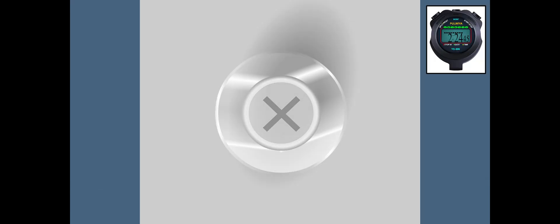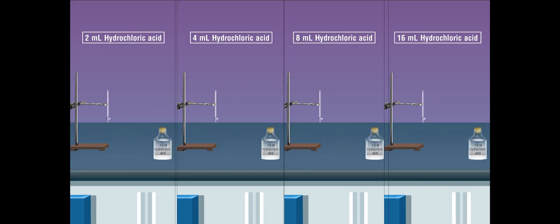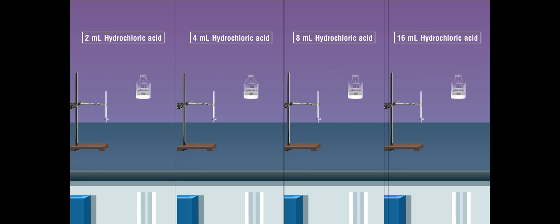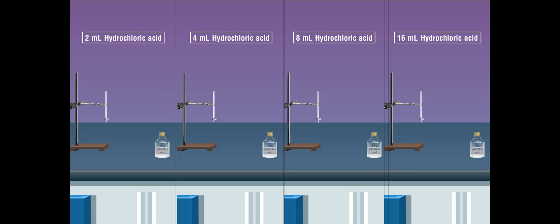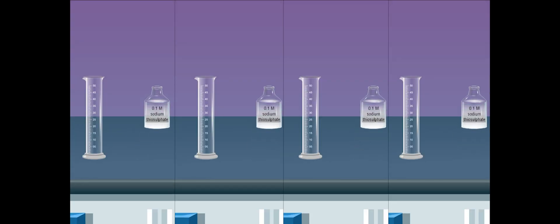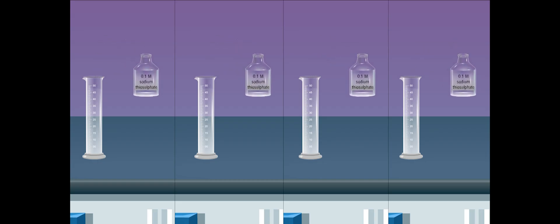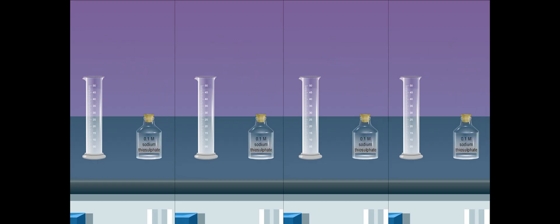Go on observing from the top of the flask and stop the stopwatch when the cross mark just becomes invisible. Note down the time. Repeat the experiment by adding 2 milliliters, 4 milliliters, 8 milliliters, and 16 milliliters of 1.0 molar hydrochloric acid solution to fresh sodium thiosulphate solution every time, and record the time required for the disappearance of the mark X in each case separately.